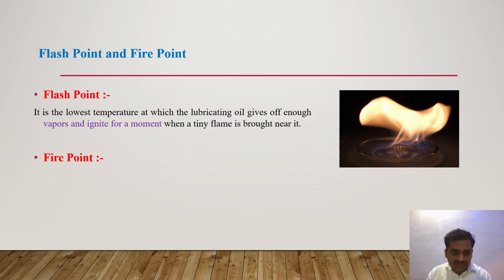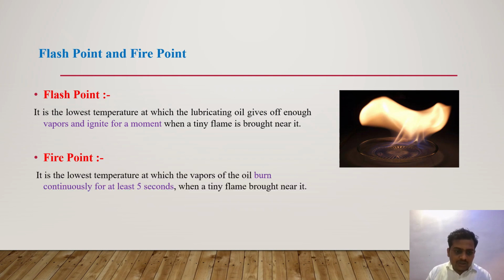The next term is the fire point. When you again start heating that oil further, the lowest temperature at which these vapors will burn continuously for at least 5 seconds when the tiny flame is brought near it, that temperature is recorded as the fire point.